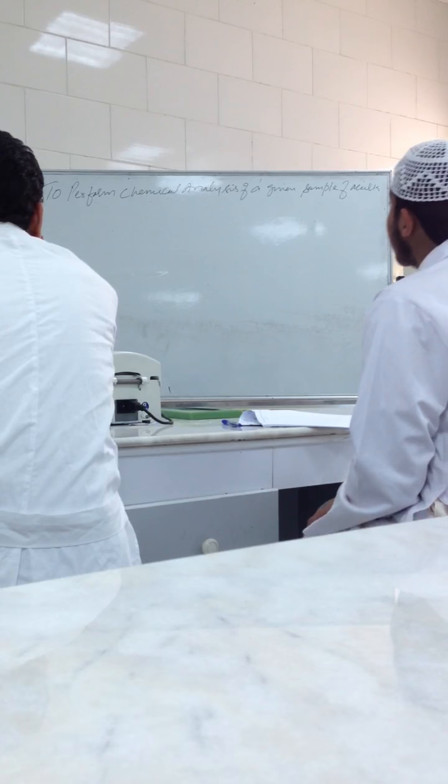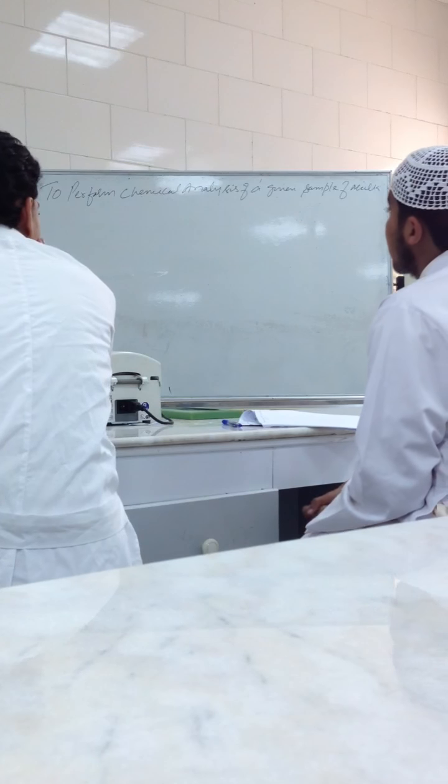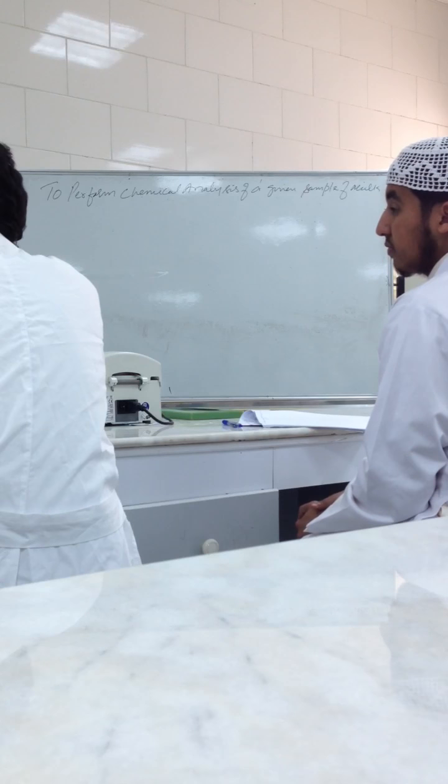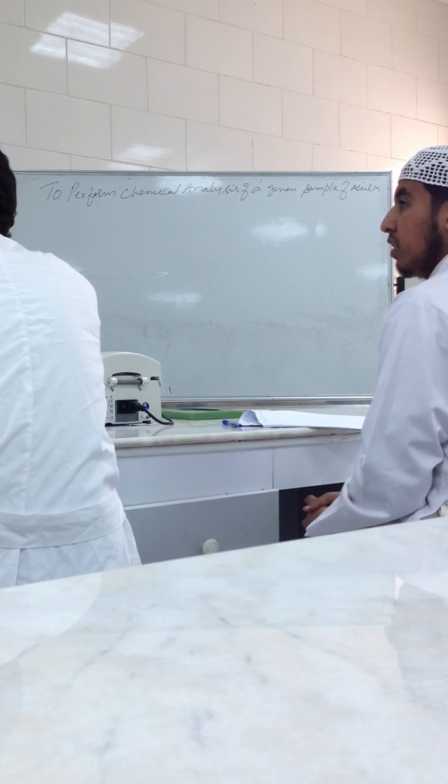Today, in the first part, we will see two things. Number one, how to prepare the milk sample for its chemical analysis.